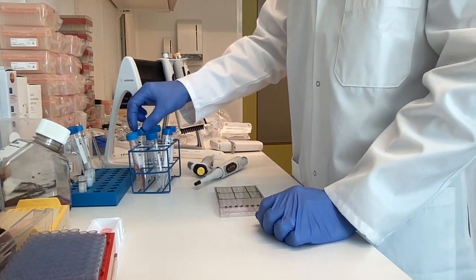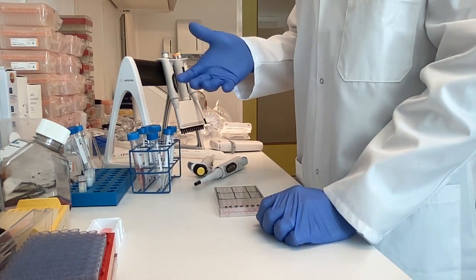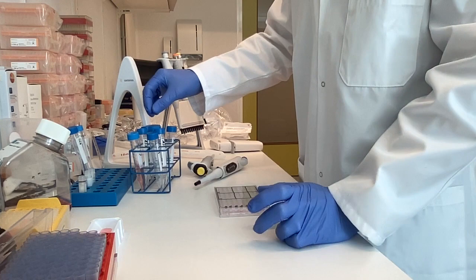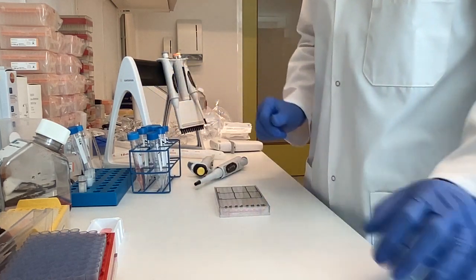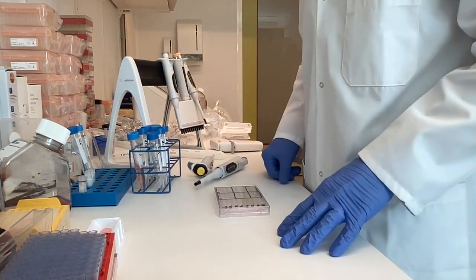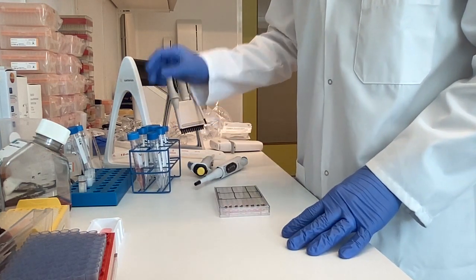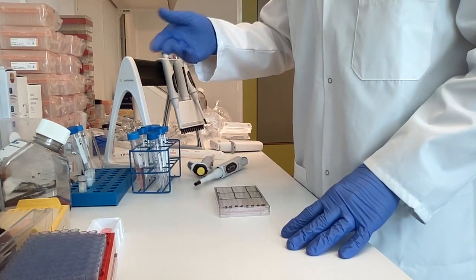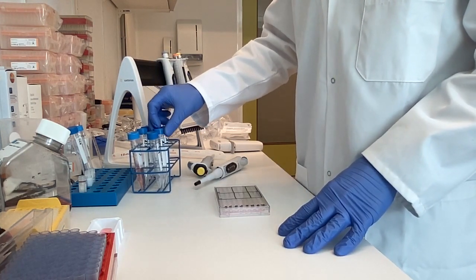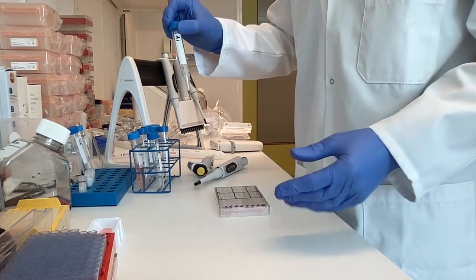For a validated test you need to test 3 different concentrations of your products, and usually you determine these in your preparatory steps. But for this video, to show you how to perform the assay, we established for this product 1 to 100, 1 to 200 and 1 to 400 as final concentration in the plate. So for your non-spiked sample we're going to make a 2x pre-dilution, because in the end we're going to dilute it once with the cells. So we're going to make the highest concentration A of sample 1 in a 2x concentration, which will be the 1 to 50.